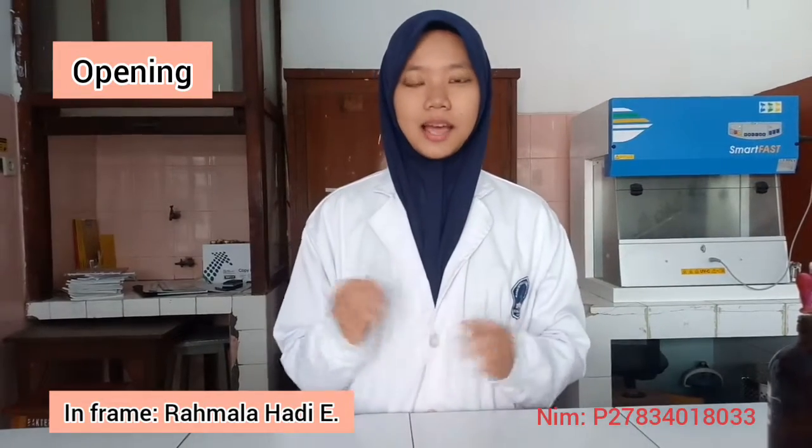The first is Ziehl-Neelsen and the second is Kinyoun-Gabbett. The difference between them is about the stain and the staining. Ziehl-Neelsen uses stain from carbolfuchsin, methylene blue, and HCl alcohol. In this method, a heating process is needed to make the stain absorbable. Kinyoun-Gabbett uses stain from Kinyoun and Gabbett. This method has no heating process because Kinyoun contains carbolfuchsin and Gabbett contains methylene blue and alcohol.